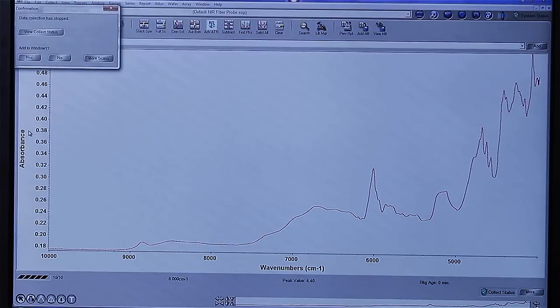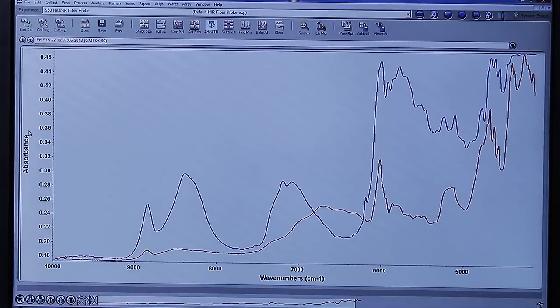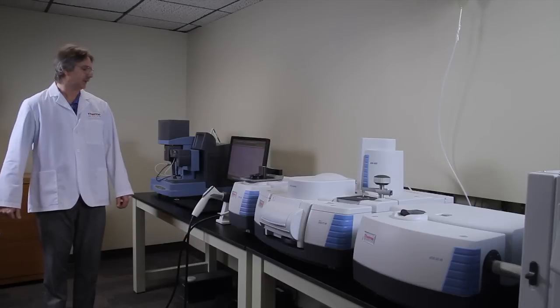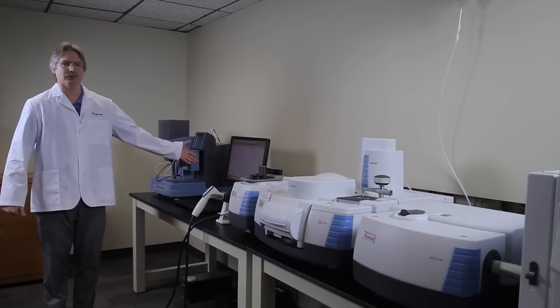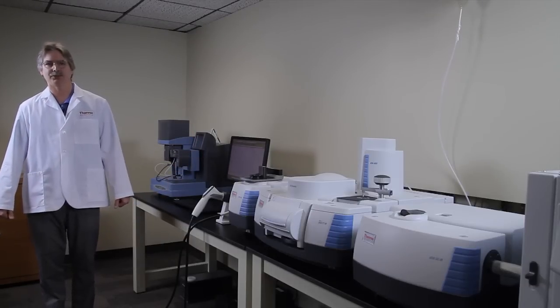Once the data is collected, it then shows up on the screen. And that's essentially all you need to do. This is the way to do analysis very easily. You just push a few buttons and you can collect your spectra.